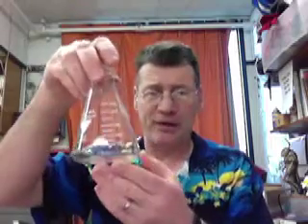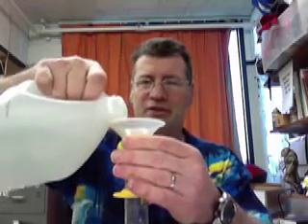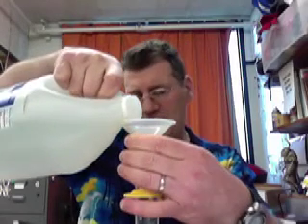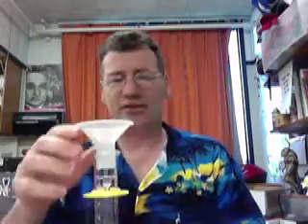So probably the best thing to do first is take and fill up your Erlenmeyer flask with about 25 milliliters of vinegar. So I'm going to just do this with the graduated cylinder, and I'm going to pour this in. You remember bottom of the meniscus and all that other good stuff. We go, a little bit, a little more. Where are we at? We're almost there. Okay, there we go. We got 25 milliliters. And pour that in your Erlenmeyer flask. Boy, isn't science fun. All right, so now it's in the Erlenmeyer flask.